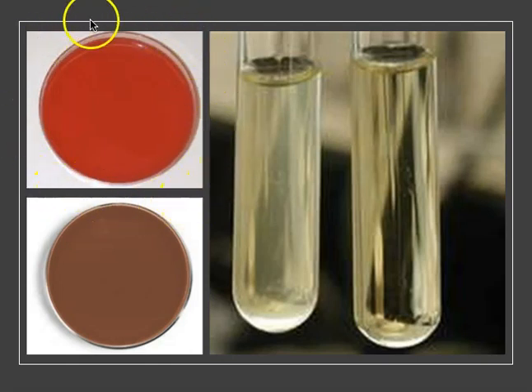We often use blood from sheep for this purpose. You can see that the agar is very deeply red, often a bright red color, and it will support the growth of many different types of fastidious bacteria.